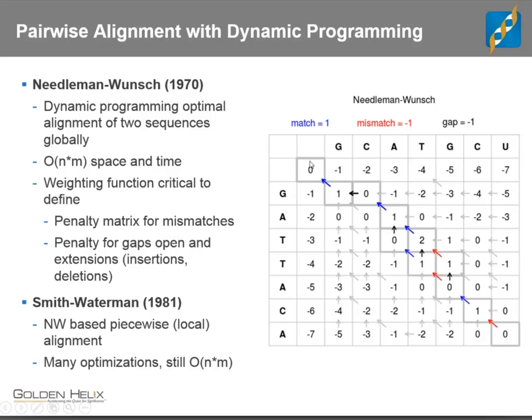I'm not going to get into how this is implemented. It would be a webcast in itself. But you're creating a table where the dimensions of that table are the lengths of the two strings. And then you also need to be able to essentially make computations for each cell of that table. So it does not scale linearly. So it works. It also is very dependent on how you define optimal.